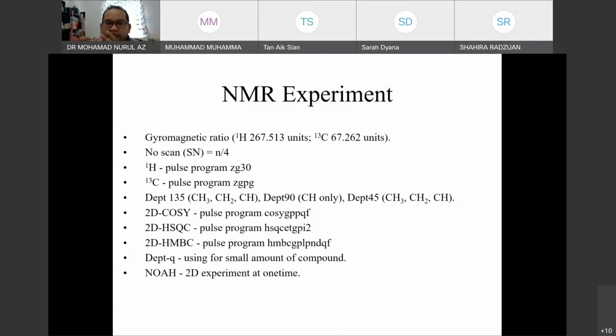They have exceptional principle when the system is JW coupling. So we will discuss later. So the HSQC is only for J1 coupling. It means carbons, where are their protons? For the HMBC, you have to measure the carbon with neighboring protons.